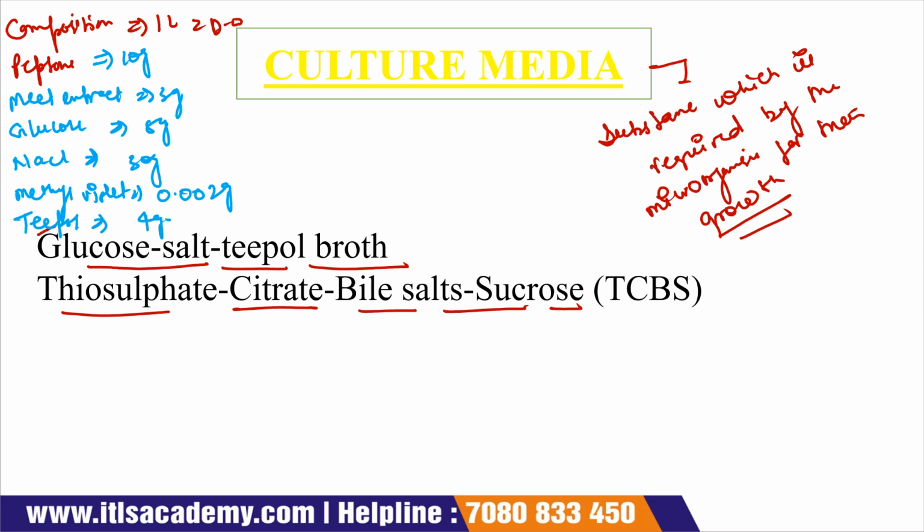If you require 500, 200, or 250 ml, you can adjust the amounts of these chemicals according to your need.